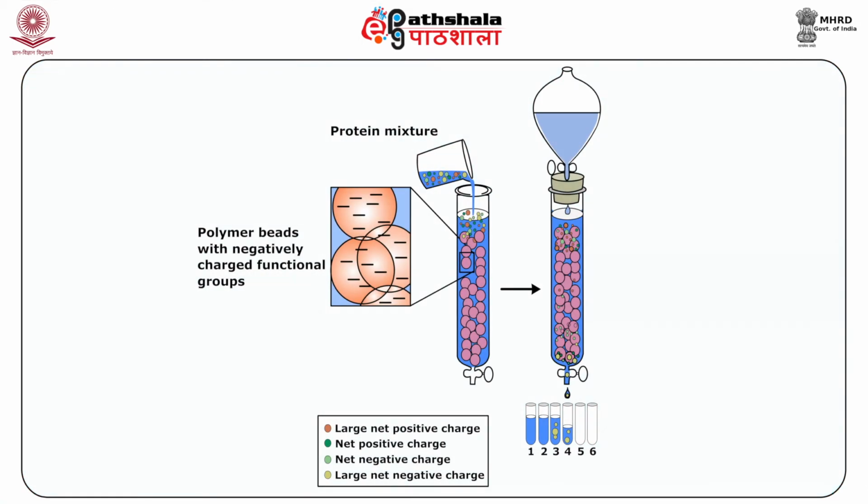Remember, we generally confuse this. The cation exchanger itself has to be negatively charged. When the protein solution is added on top of the column, the movement of positively charged proteins is impeded because of its interaction with these negatively charged exchangers, while the negatively charged proteins move faster. Thus, two proteins with opposite charges make two distinct bands and are eluted in different fractions.